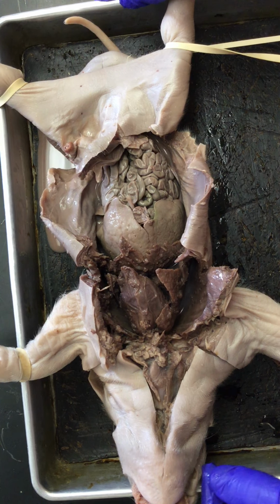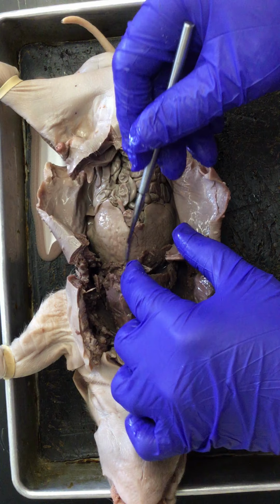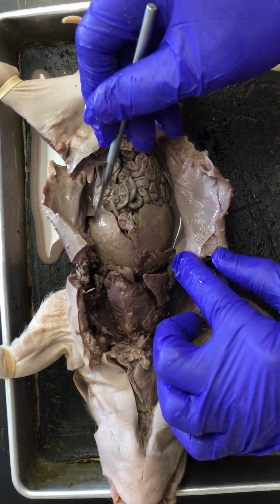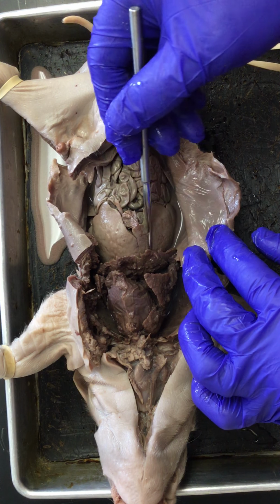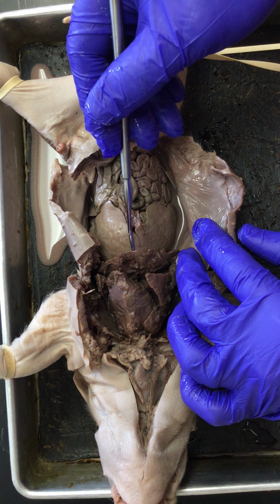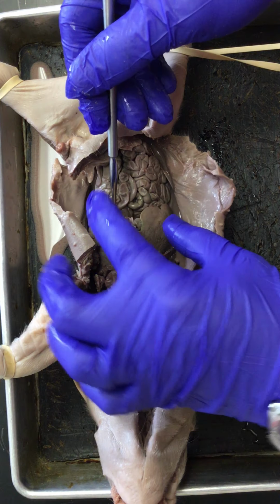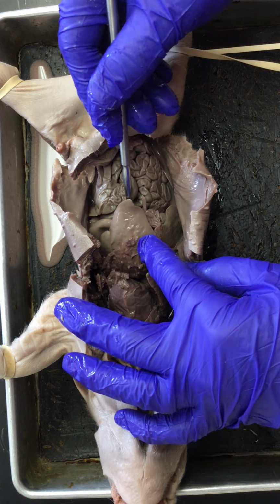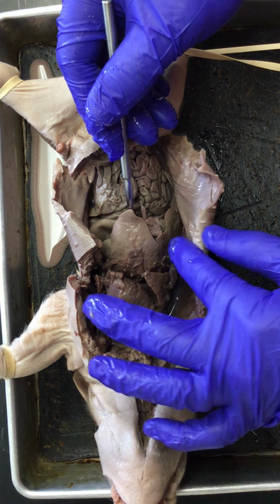All right, so now we've got a really opened up pig and we can start to look at some structures. First thing I'm going to call your attention to is this. The largest organ inside the pig, at least in terms of mass, is the liver. So this is the pig's liver. It's situated a little more to the right than it is to the left. Sorry, I'm getting turned around looking at the video and the pig. So the liver normally sits over here. It's actually why the heart sits a little bit to the left, because the liver is so large and it sits a little to the right.